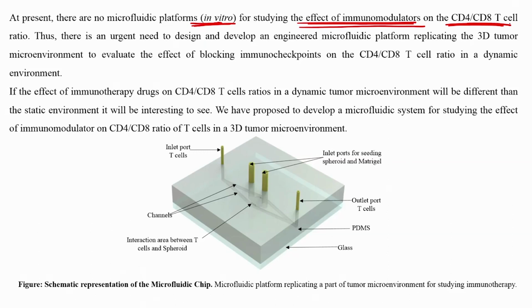Thus, there is an urgent need to design and develop an engineered microfluidic platform replicating the 3D tumor microenvironment to evaluate the effect of blocking immunocheckpoints on CD4 CD8 T cells in a dynamic environment, right. So, if you want to check the effect of immunomodulators on CD4 CD8 T cells, we need a dynamic platform, but currently there are no microfluidic platforms that are used for this kind of study.